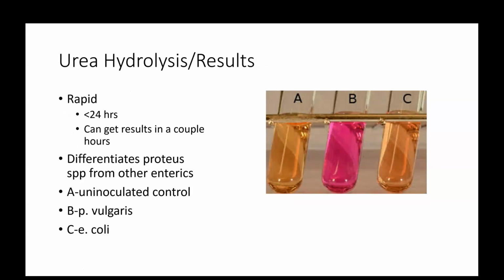So what happens here is that urea is present in, again, think about a bacteria that's hanging out in our urogenital tract. It needs the most available nutrient resource, and one easy source of nitrogen is urea. And it can take urea and convert it into ammonia and carbon dioxide, and then it can utilize that ammonia and incorporate it into some anabolic pathways to build precursor metabolites.